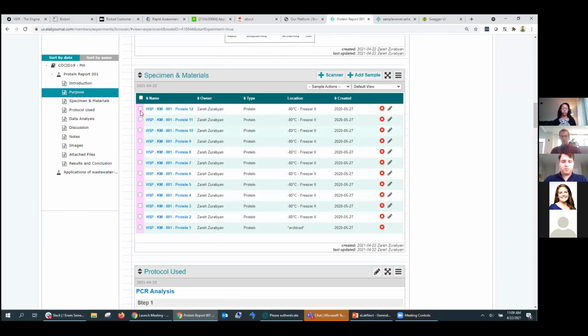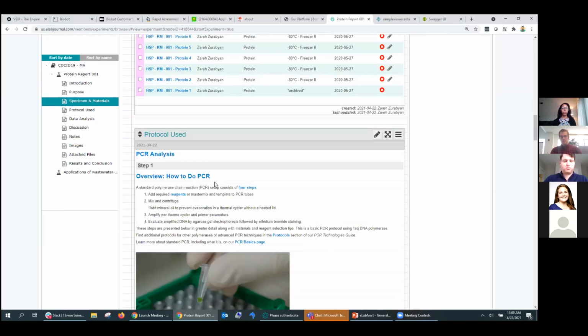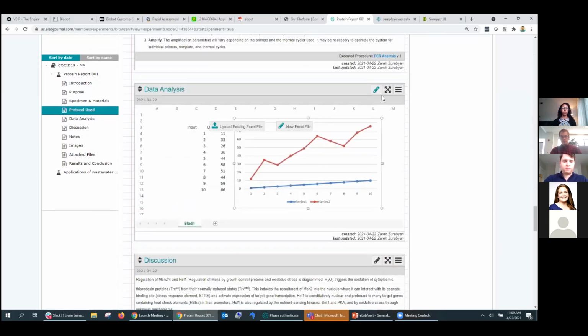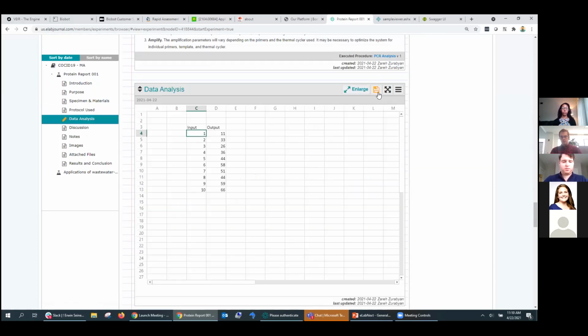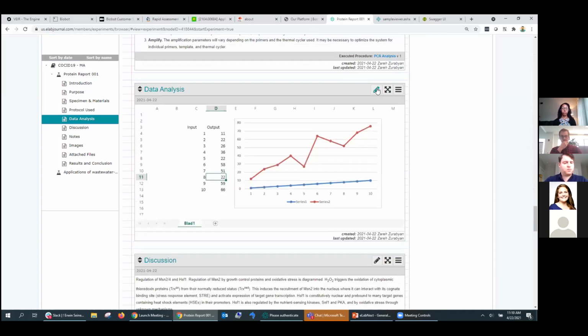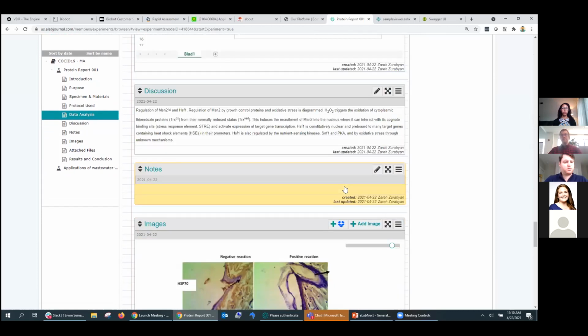My samples, most likely I need to remove them from this. My PCR analysis is in here. So also my Excel with all of its, let's say, calculations is in there. Now, all I have to do is just go ahead and change some of the things without altering the template. And now I've saved a lot of time in this reporting.